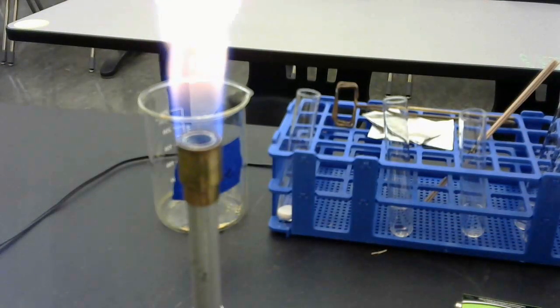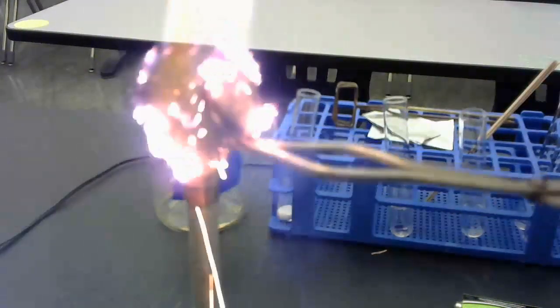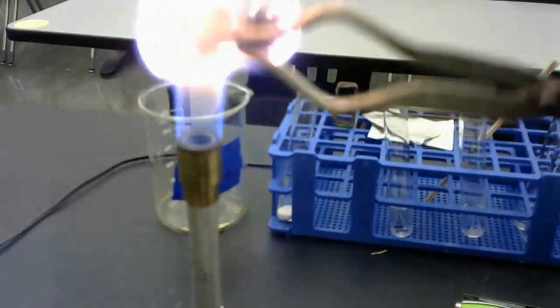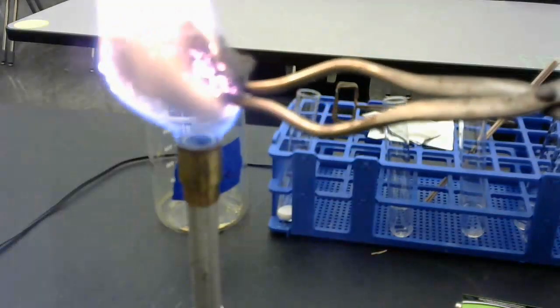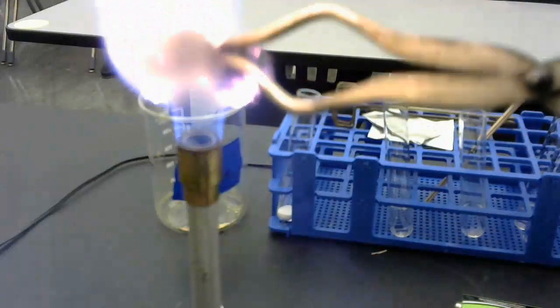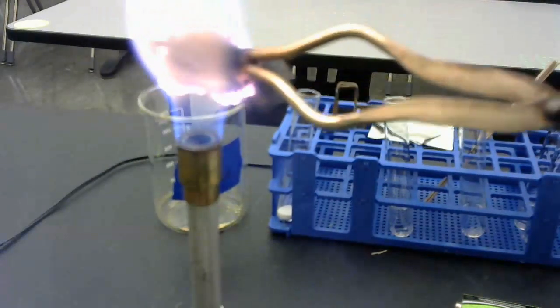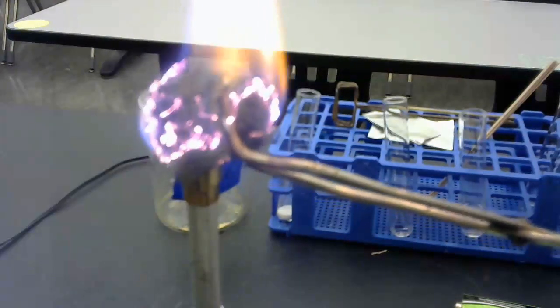It says use crucible tongs to heat the piece of steel wool, which is iron, Fe, strongly in the Bunsen burner for about 30 seconds. So I'm going to bring that over, and you can see some pieces are falling off a little bit, but it's definitely burning there. I'm going to burn that for a little bit. You can see the flame going through the piece of steel wool really well.